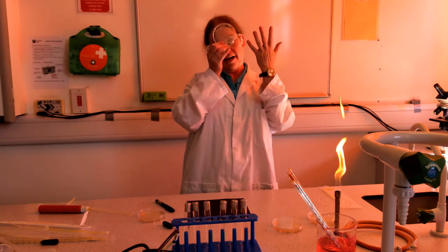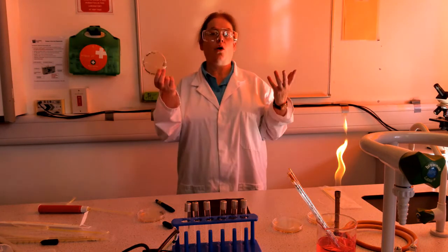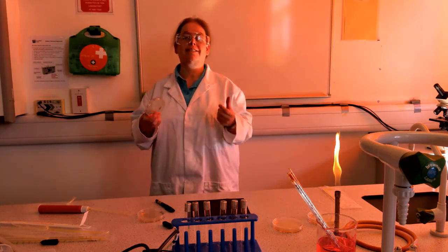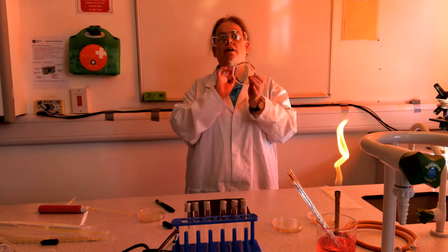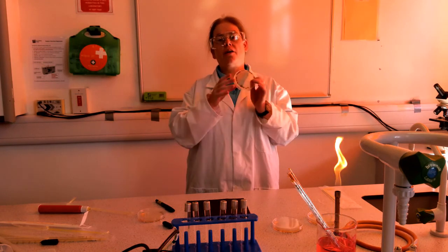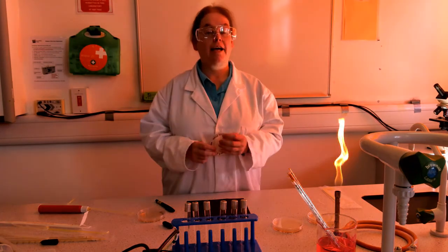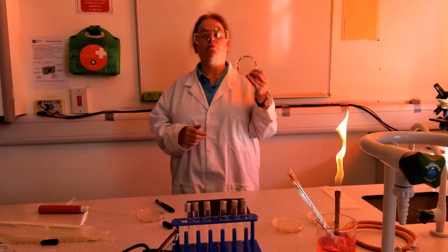However, if I count this and I find 1,007 colonies, that tells me that on Monday there were 1,007 individual bacteria in my 10,000 dilution. If I then multiply that number by 10,000, that will tell me how many bacteria there were in 0.1 millilitres of my original culture.